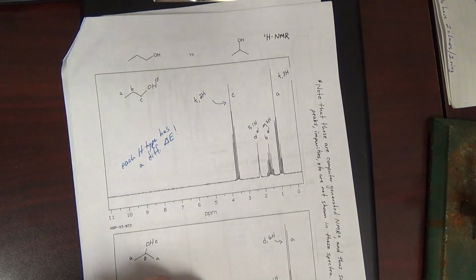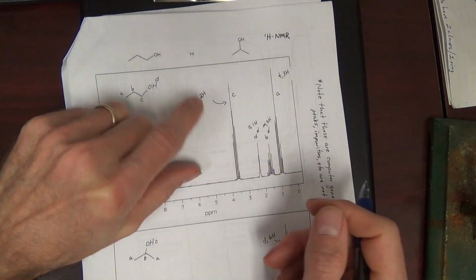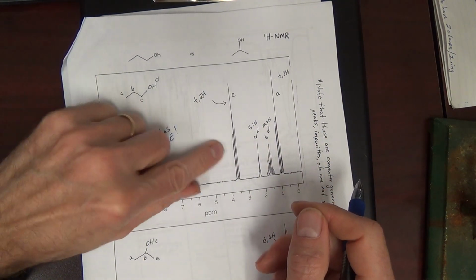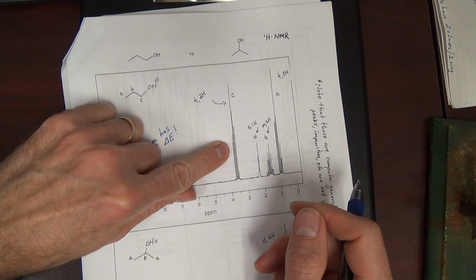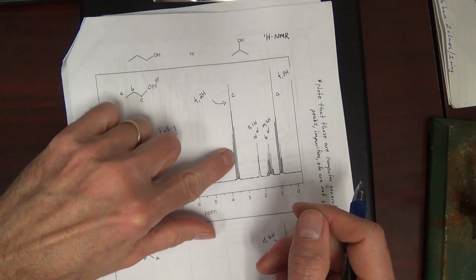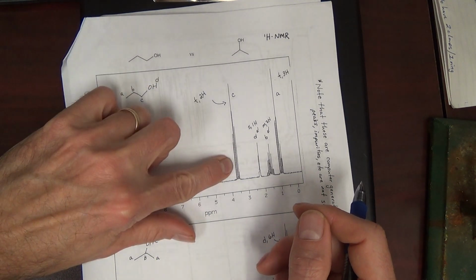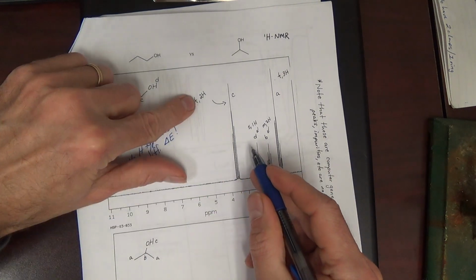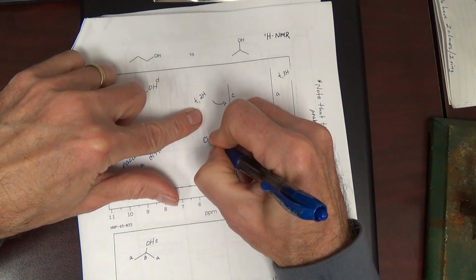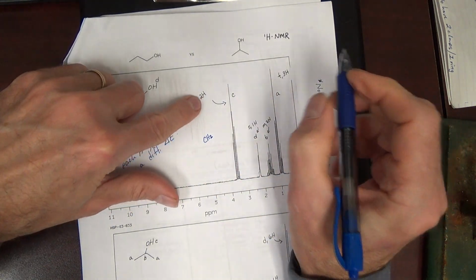Sort of go in reverse and ask, very important when you want to come up with structure from a spectrum: why is this signal a triplet? And how many H's is this signal for? It's for 2 H's. That's the integration, okay? There's no integral line, but I'm giving you that. It's a CH2. Now, it could theoretically be 2 CHs that are identical, but it's a CH2.